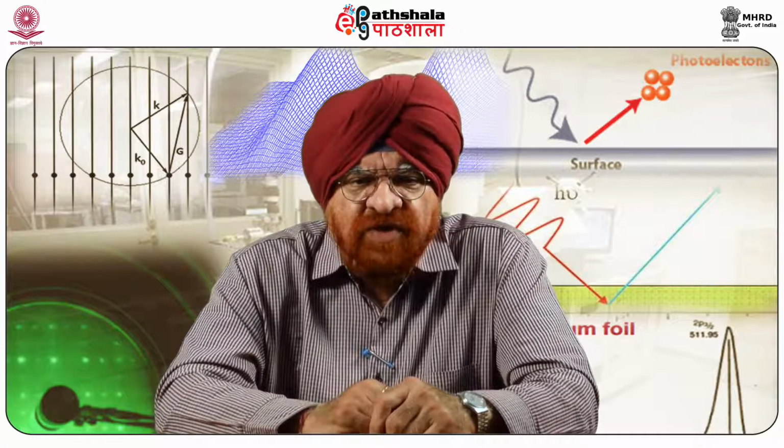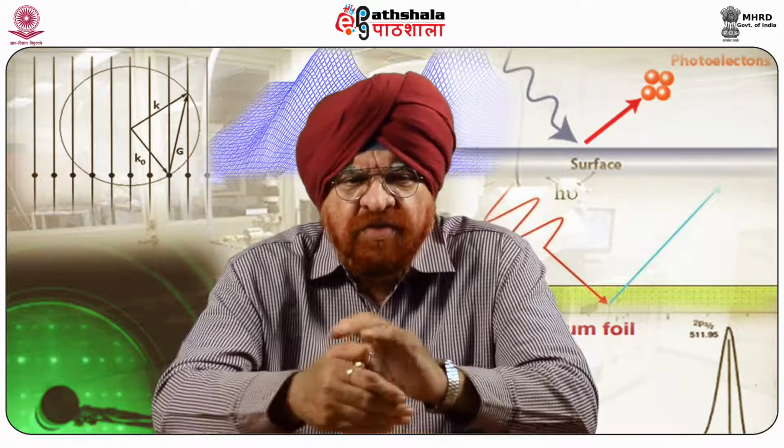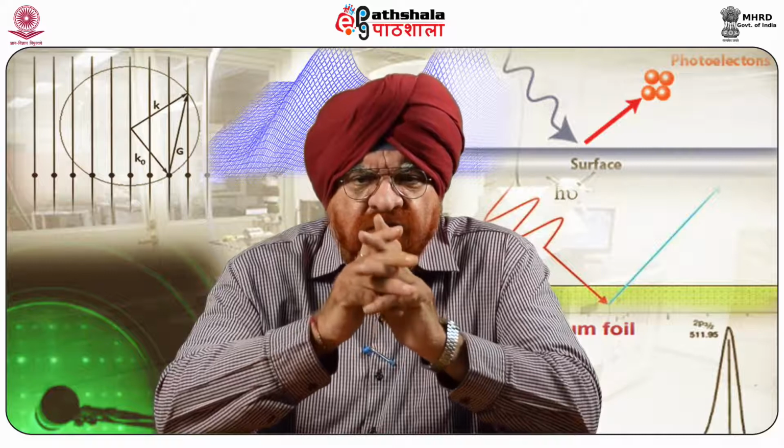While the cantilever maintains a constant separation while scanning, the significantly lower forces of non-contact mode than contact mode allow even the softest sample to be imaged without damaging it.